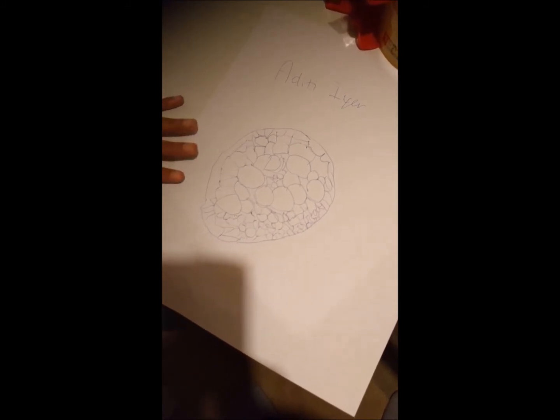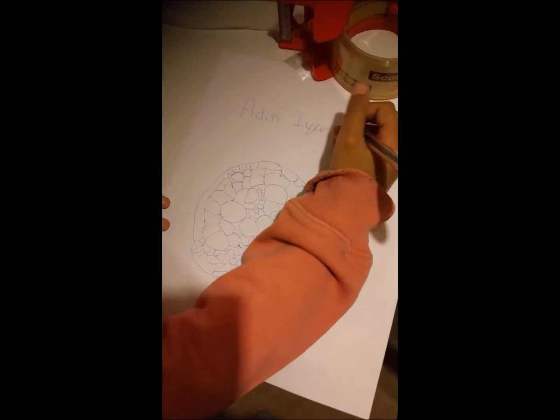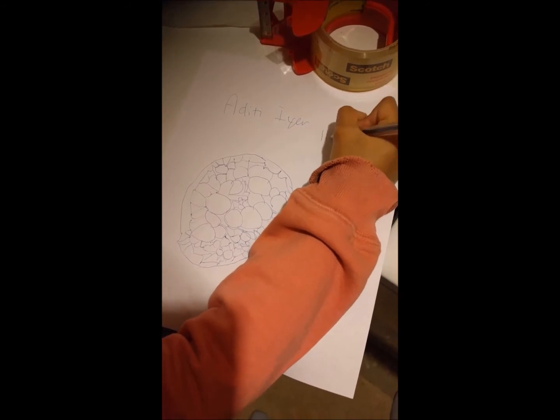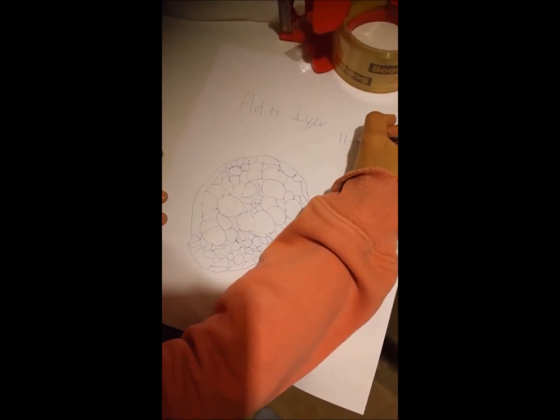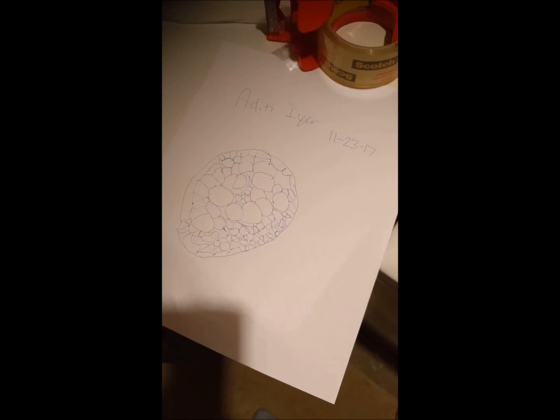We are back to our setup and this time it's way easier to just hold this up and project it down. Turn off the light. Why don't you write today's date — it's already the 23rd of November, one o'clock past midnight. So: 11, that's 23. And then call it the fern rhizome.